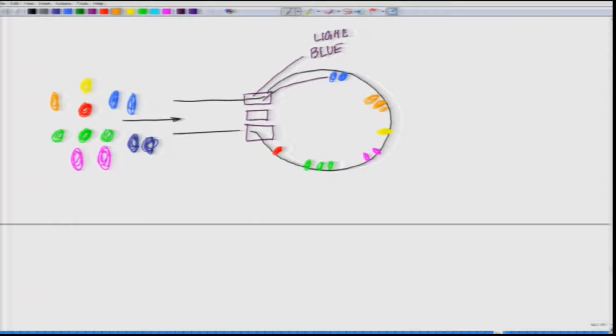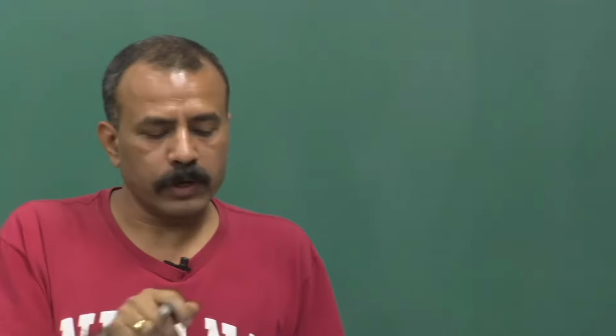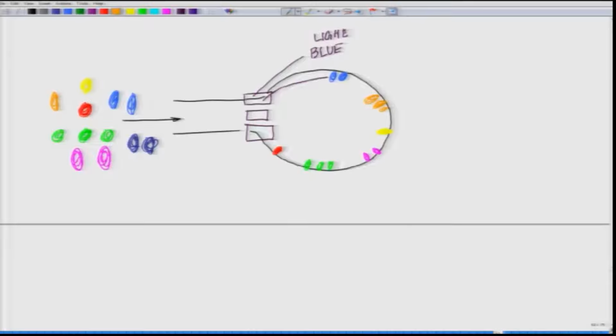So, what I wanted to say is, say for example, on the cell surface you have specific markers. If you consider these as different cells, instead they are individuals holding different color tags of tickets. So, I have this color, and okay, for you this place is reserved. For light blue this place is reserved, for light green this, for pink this, for yellow this part, for red this part is reserved.